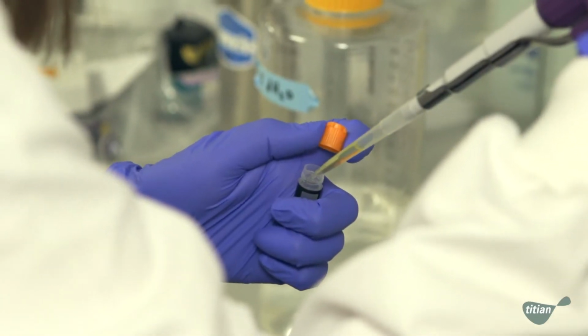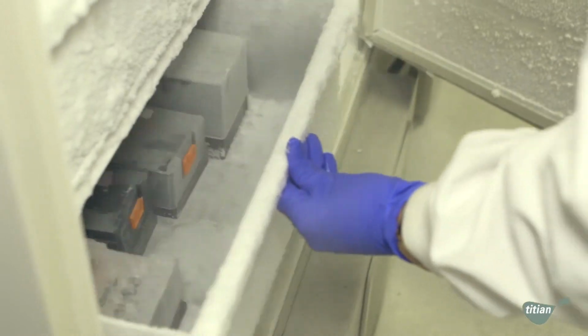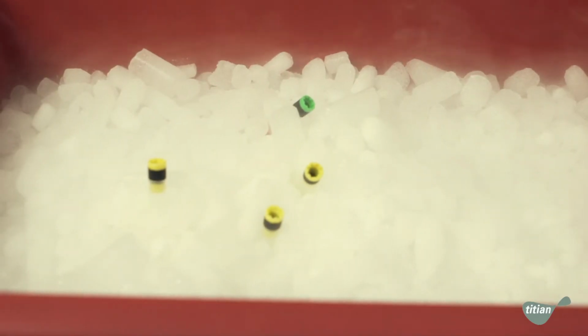Generally what we get from most of our patients or donors is peripheral blood. We will sometimes get urine as well. We process the blood down into different components. So we will isolate things like serum, peripheral blood mononuclear cells or PBMCs, we isolate monocytes, CD4 T cells, and we store all of these. So there's quite a lot of individual derivatives from a single patient sample.